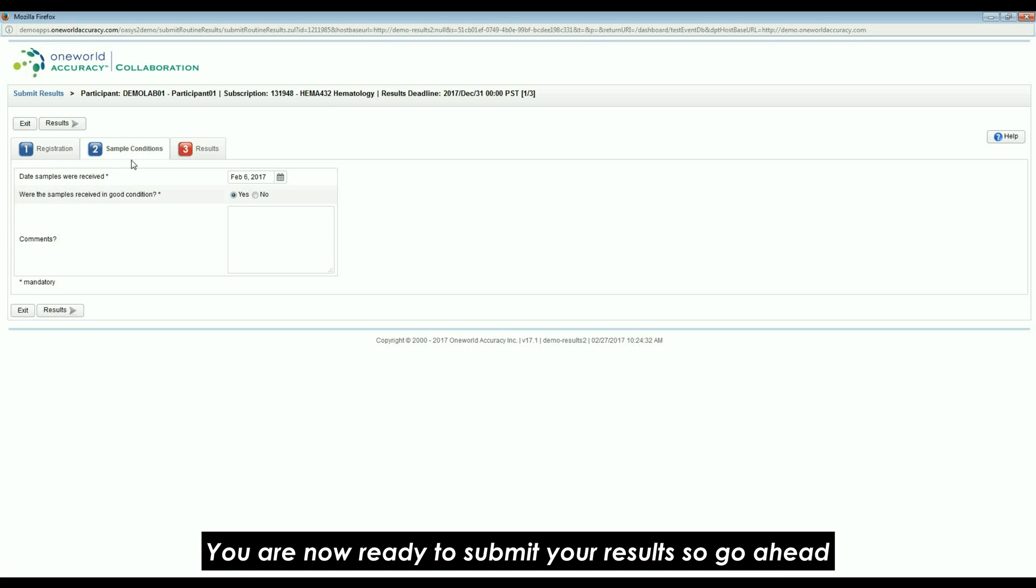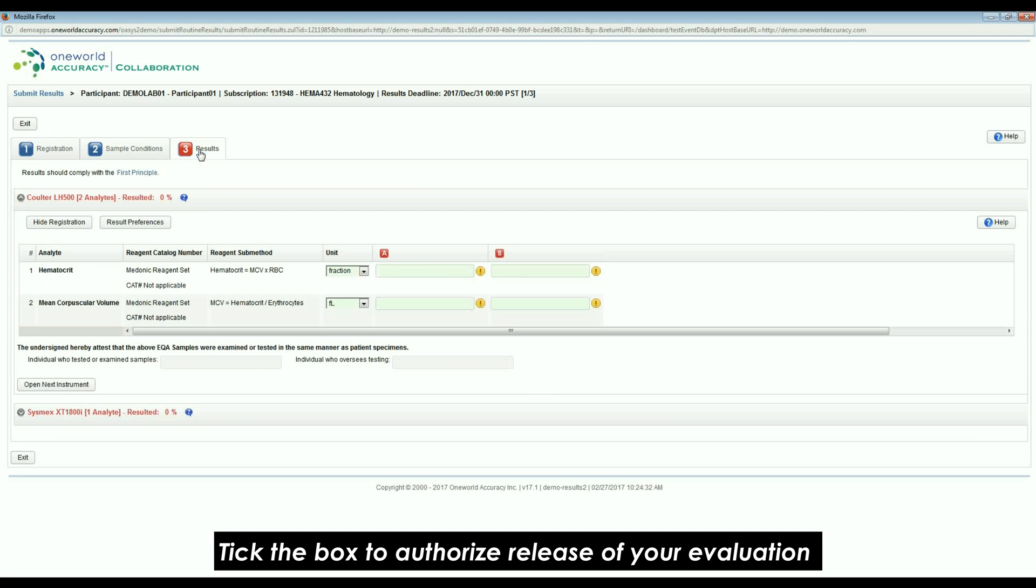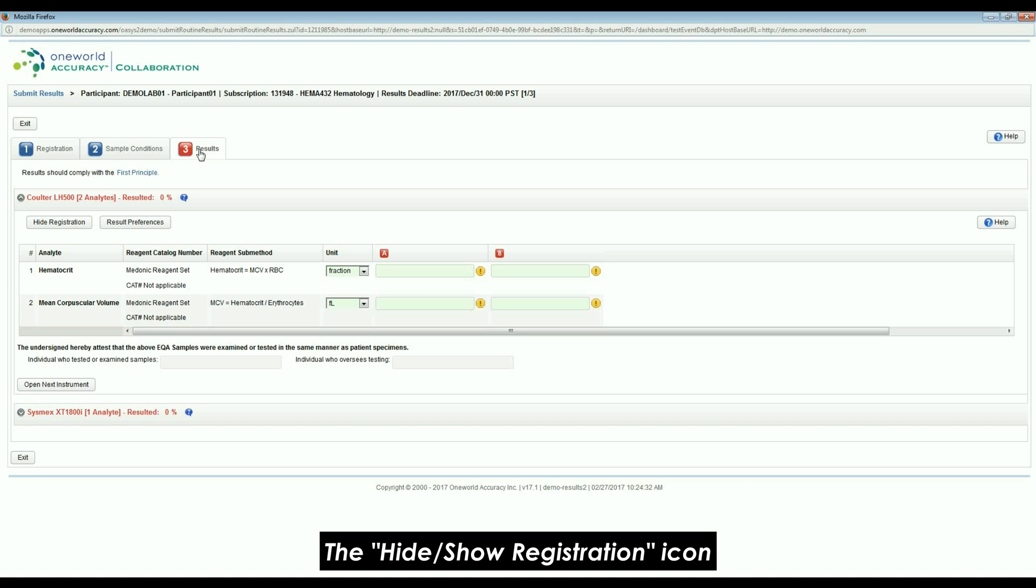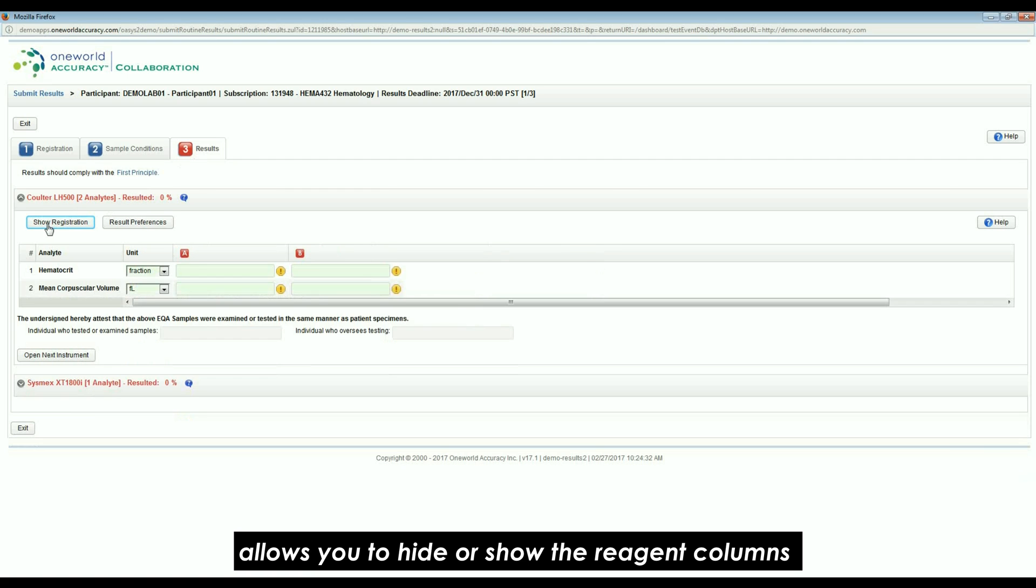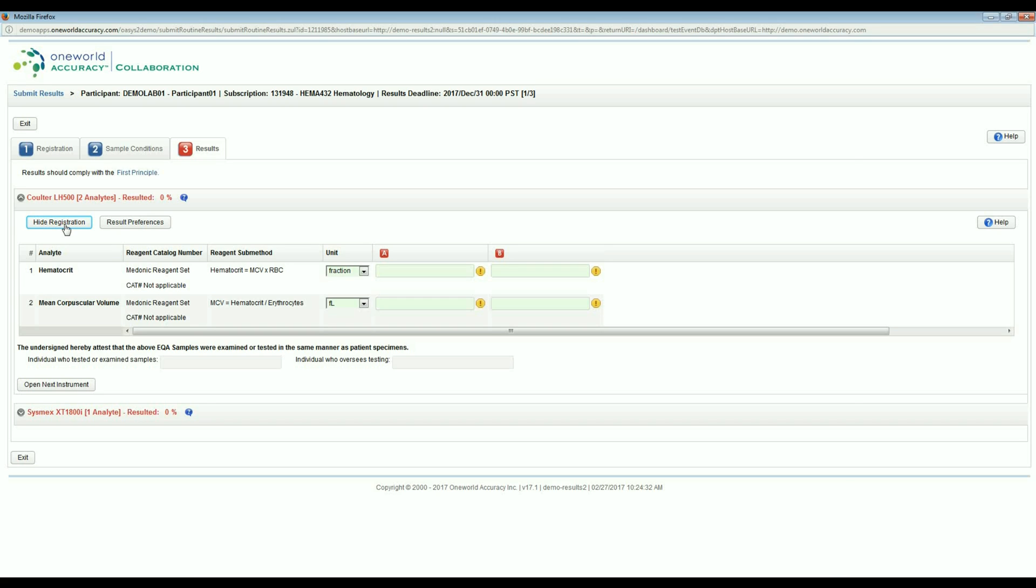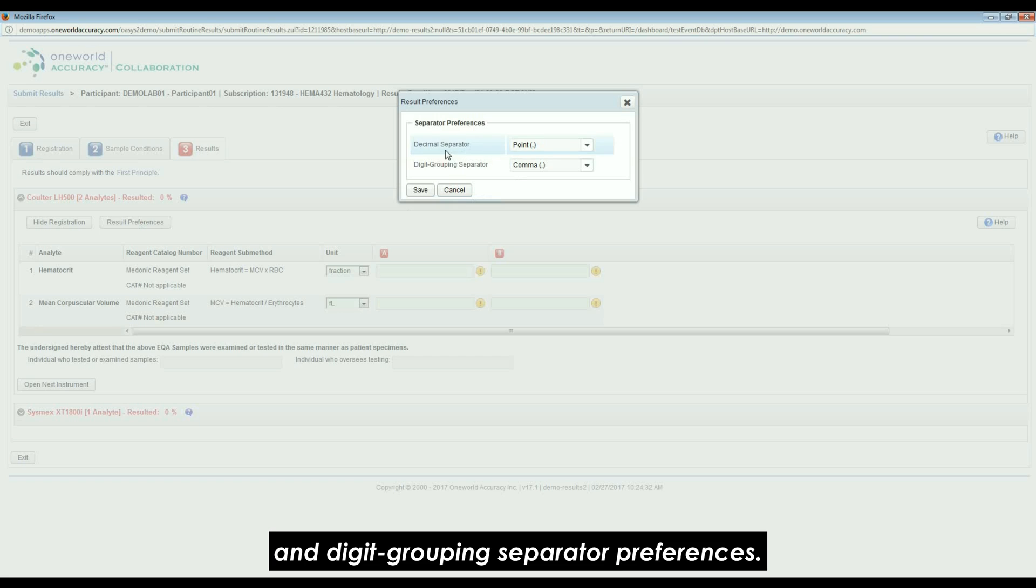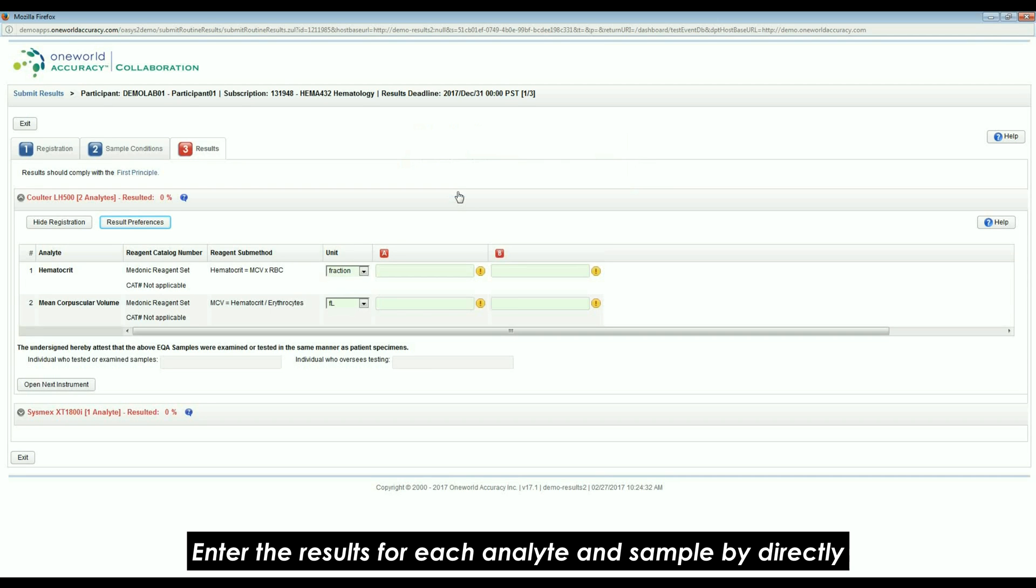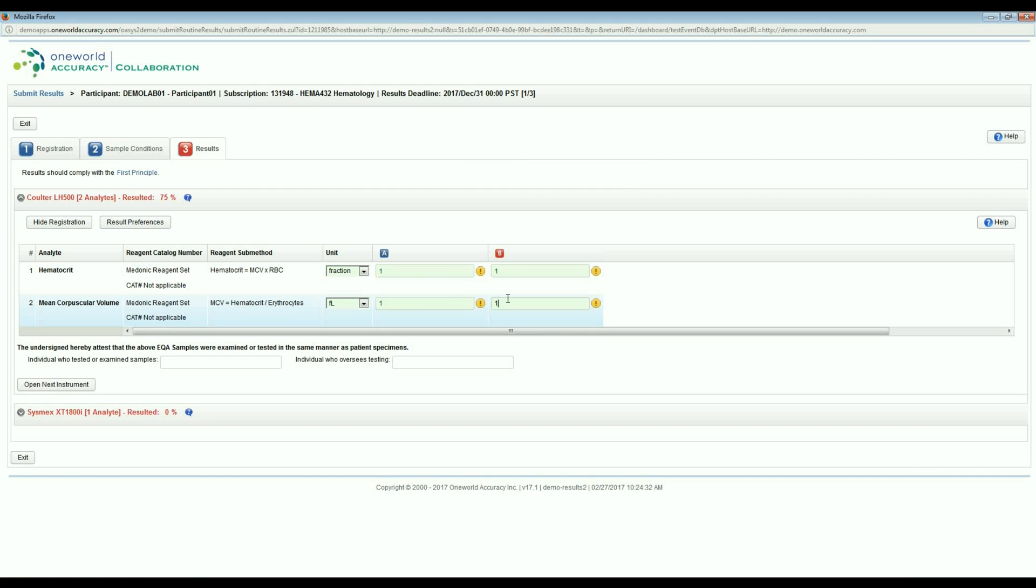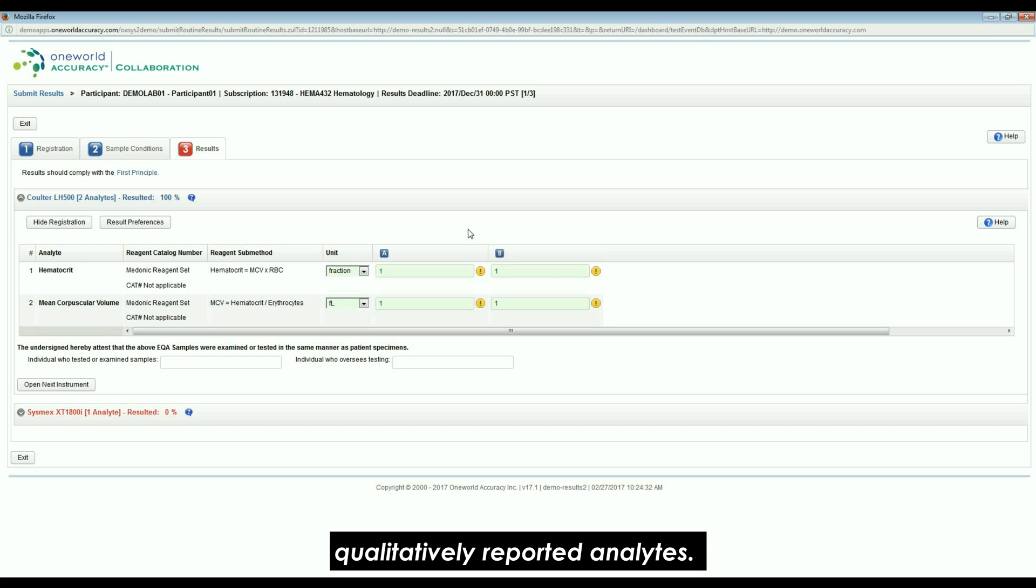You are now ready to submit your results, so go ahead and click on the Results tab. Tick the box to authorize release of your evaluation to an accrediting body if applicable. The Hide Show Registration icon allows you to hide or show the reagent and calibrator columns. The Result Preferences icon allows you to update your decimal and digit grouping separator preferences.